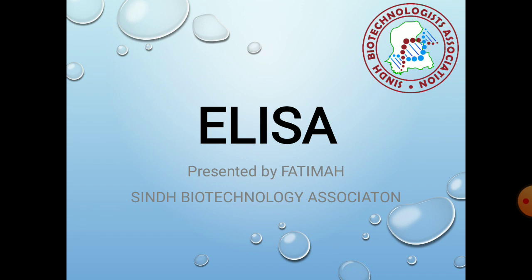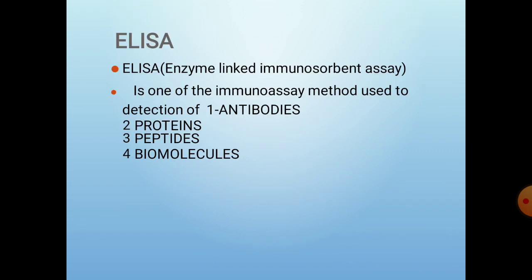ELISA is a plate-based assay technique designed for detecting and quantifying soluble substances such as peptides, proteins, antibodies, and hormones. ELISA is one of the most common methods used for the detection of antibodies, proteins, peptides and biomolecules.